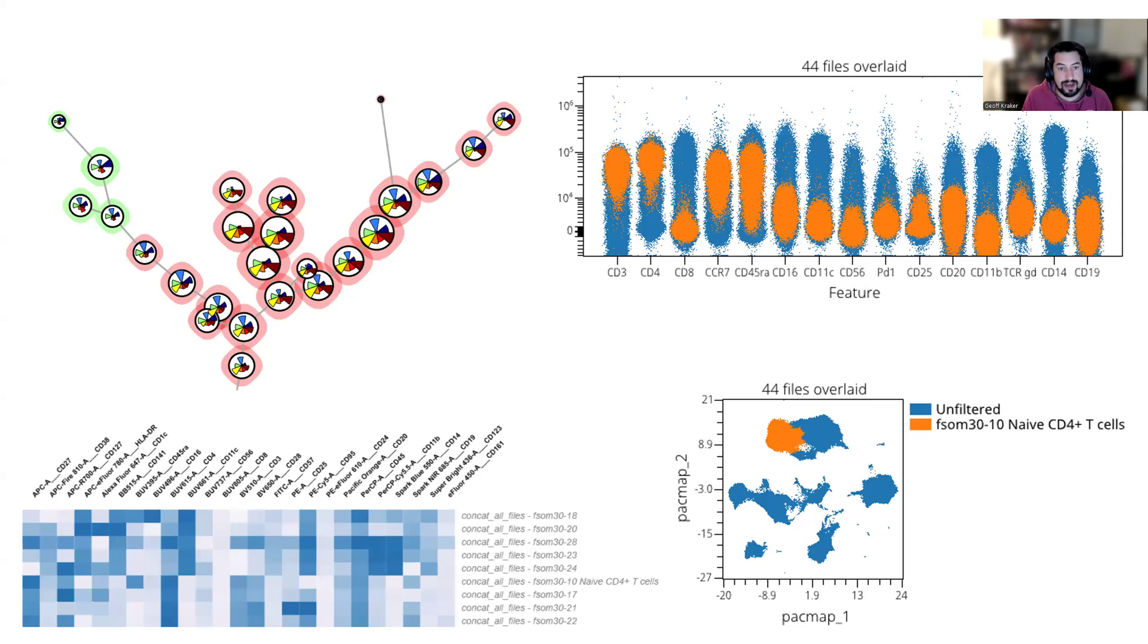Here's some examples of how to visualize clustering data. We have this classic minimum spanning tree with, in this particular case, these star plots. The larger dots represent more events. The smaller dots represent fewer events. The colored halos are the different metaclusters these clusters are part of. This is a classic way to look at clustering data.